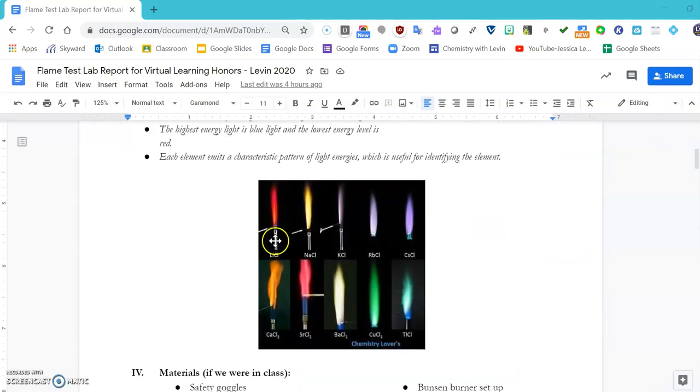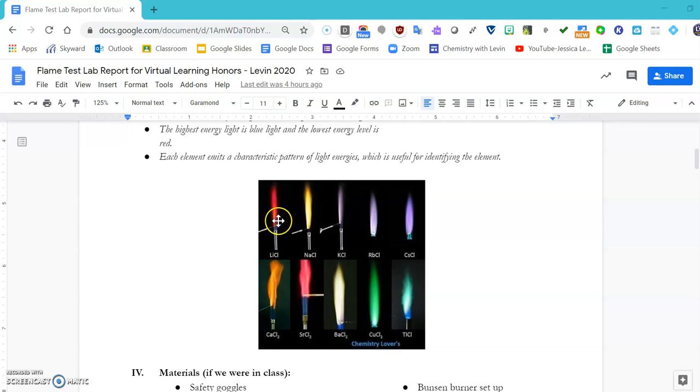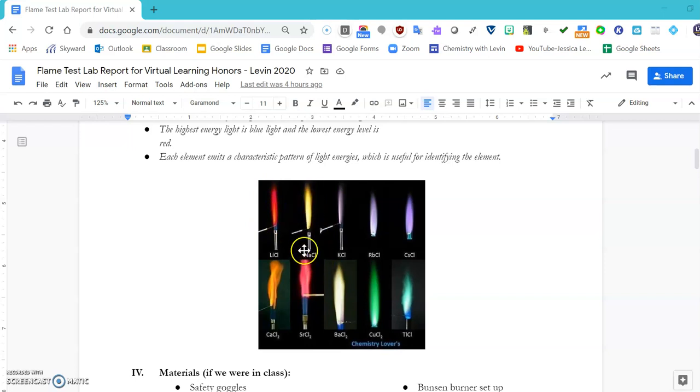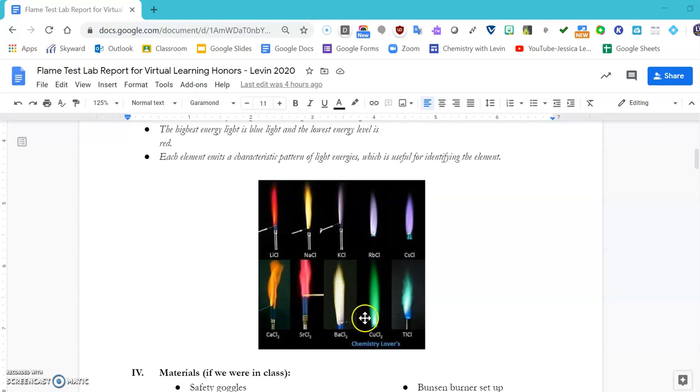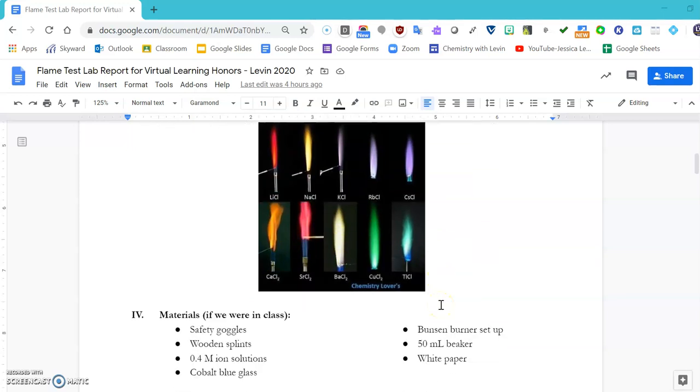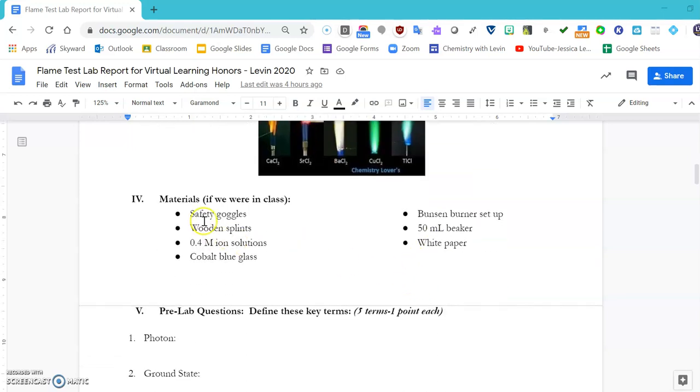We see different characteristic colors for each of our specific elements. The flame test for lithium is this beautiful red with a little bit of orange tint. Sodium is a characteristic yellow like our sodium lamps in the street. Potassium is purple, so is rubidium and cesium, and we also have calcium, strontium, barium, copper, and thallium.